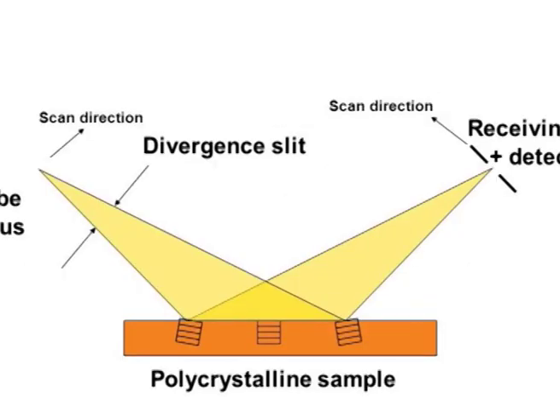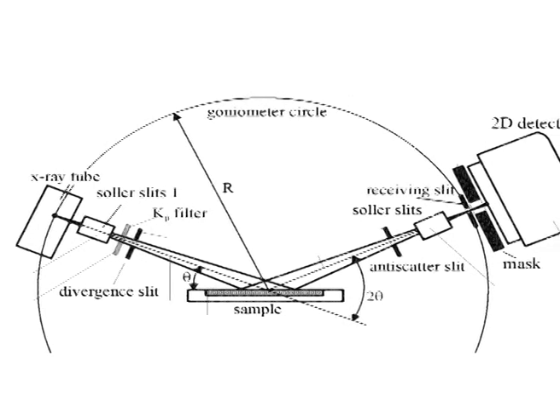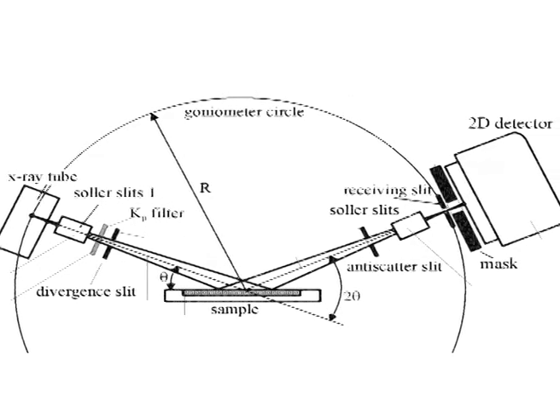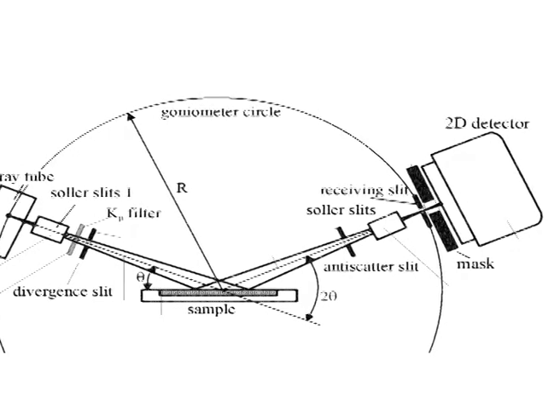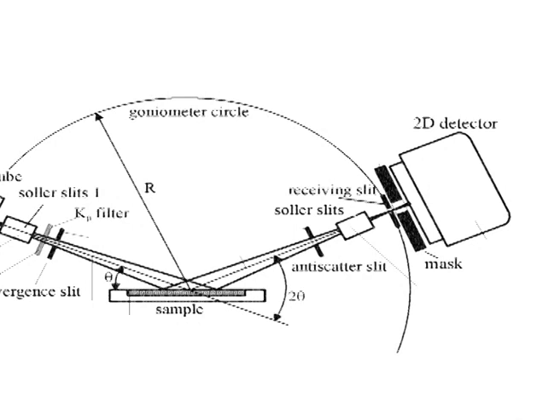Here the sample is sitting on a flat plate and the plate is turned about the center of the diffractometer at half the rate through which the counter moves. This is the Bragg scan method. Notice the plot contains 2 theta on the x-axis and X-ray intensity on the y-axis. Figure 9 shows the diffractometer's beam path in the theta by 2 theta mode.